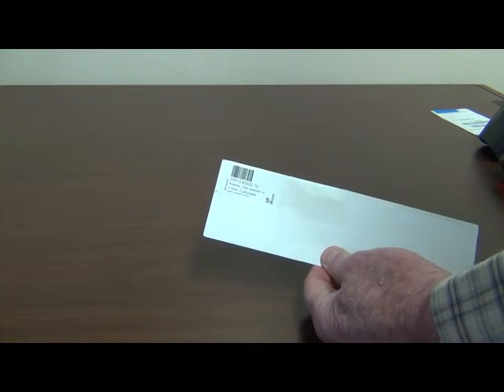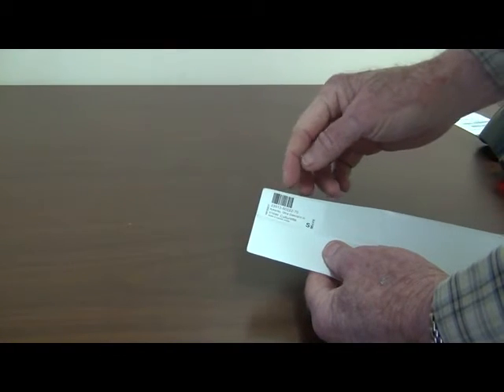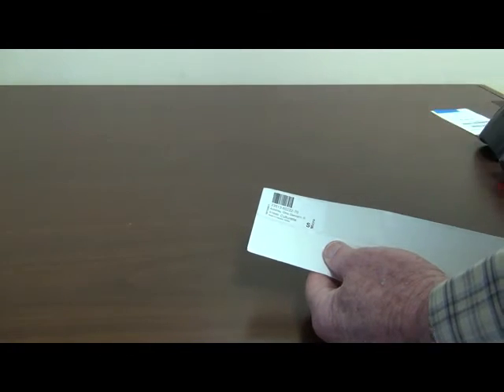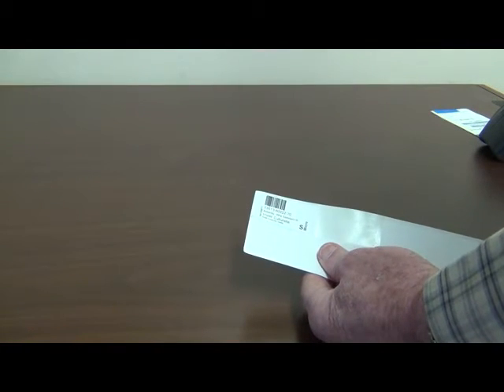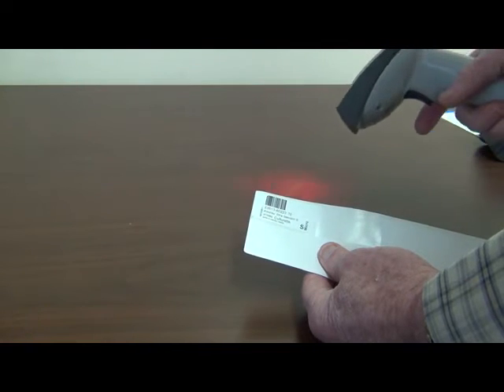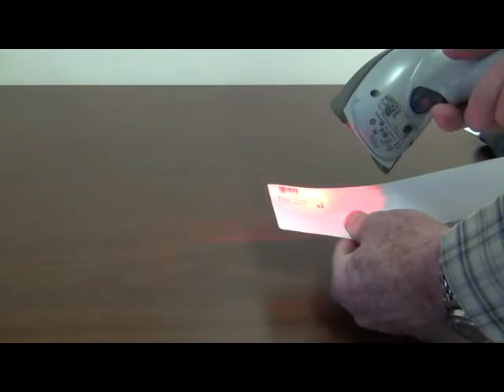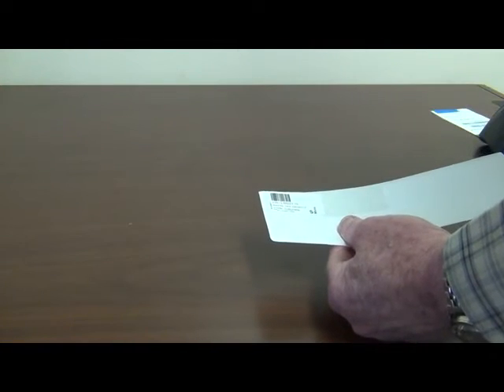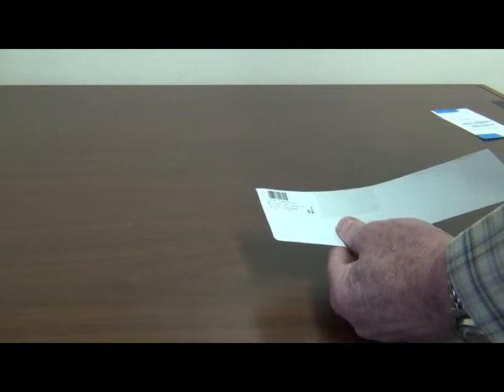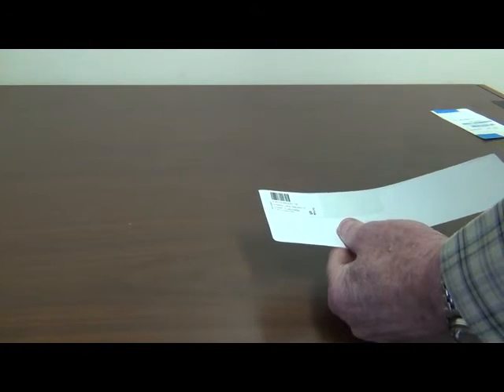If it's good, you can take another look at it and test what the X dimension is. If the X dimension is very, very small, then it may be out of the range of barcodes that your particular scanner can handle. I showed you that this one cannot handle that, whereas this one has different optics and it can handle it.